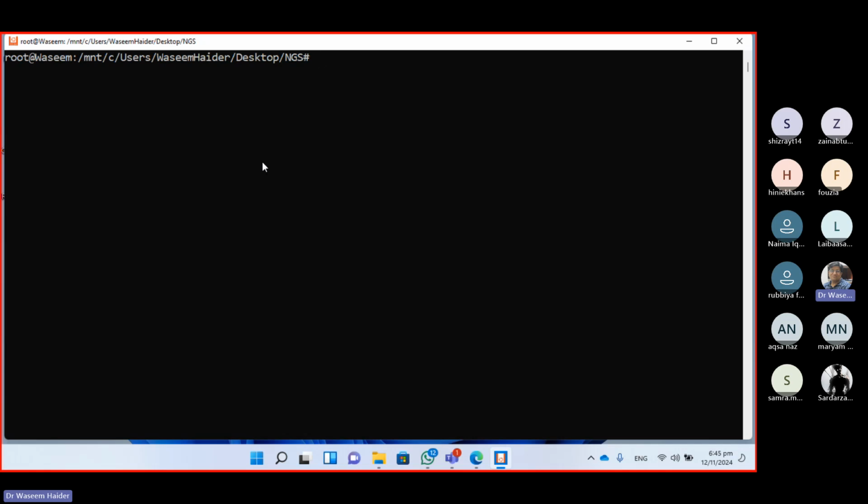Why don't we use BLAST here? Because what BLAST does is take the original sequence and break it into small fragments or chunks, and take the reads and again break them into small chunks, and wherever you get the highest pair, in terms of any piece from the read and any piece from the reference, that pair will be reported. That we don't want actually.